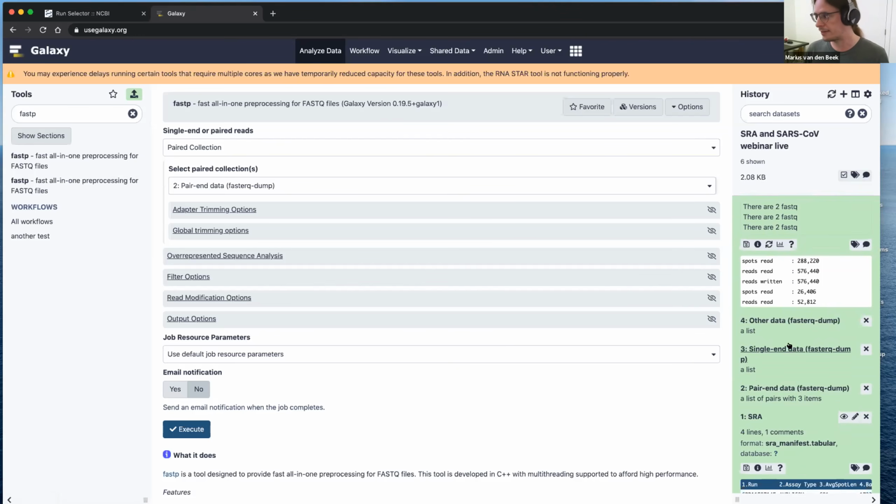In practical terms, we often separate them so that we can run a series of analysis. We can run workflows, which are a series of analysis. And then we first pick the paired end data sets and then the single end data sets because they may need different parameters. But in principle, you can download single end and paired end. And it doesn't have to be Illumina. It can be anything that the SRA hosts. So Oxford Nanopore, Ion Torrent, all data sets.